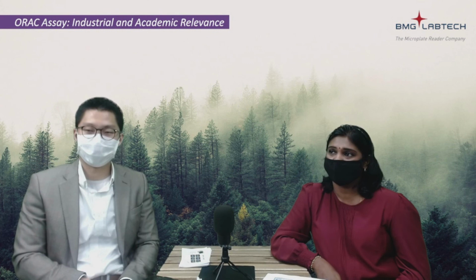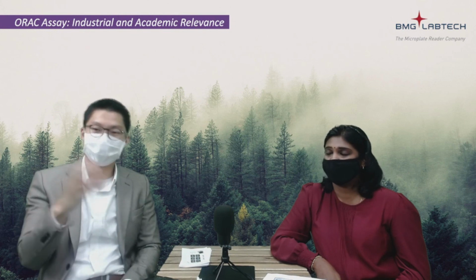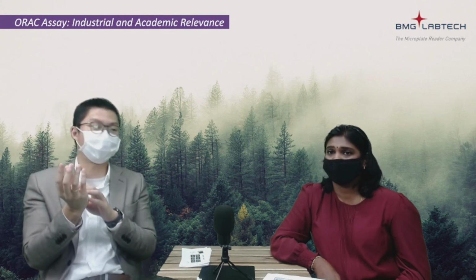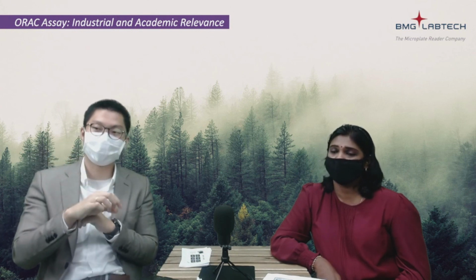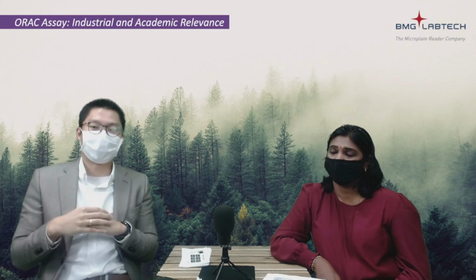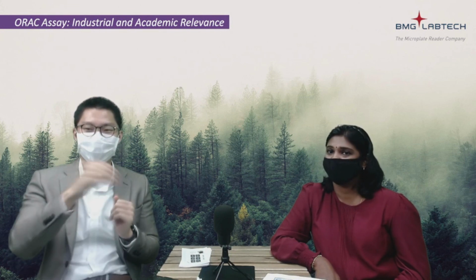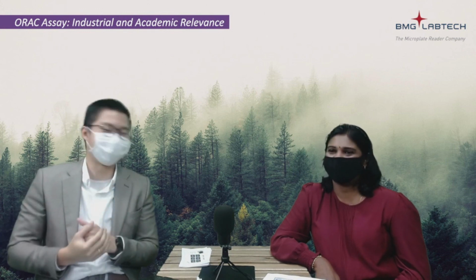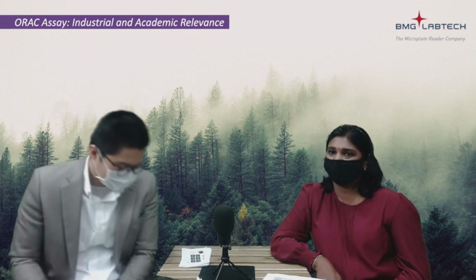So I think like Shalini showed in the protocol earlier, she used our reader, and our reader has an automated injector on board. So you can actually use the automated injector. Basically you just have a vessel or tube with the radicals, and then it will automatically inject at the cycle that you want for all the plates. So the advantage definitely is time, because asking the machine to inject for you will be way faster than using our hand, for example. Yes. So definitely there will be some signal difference, I would say.